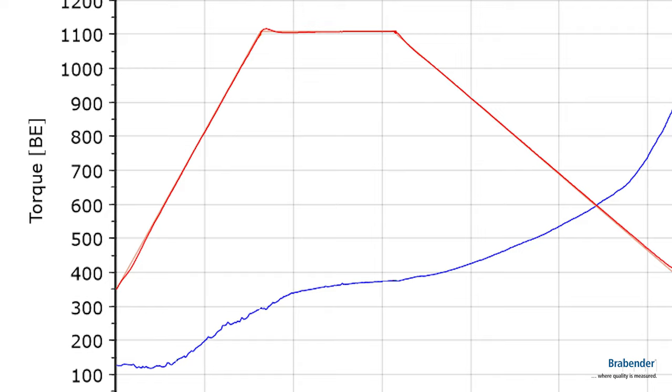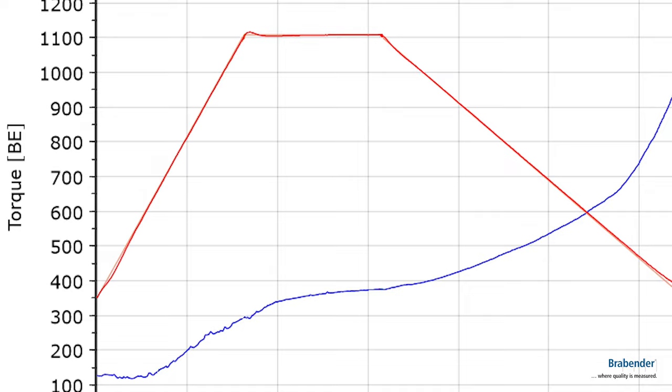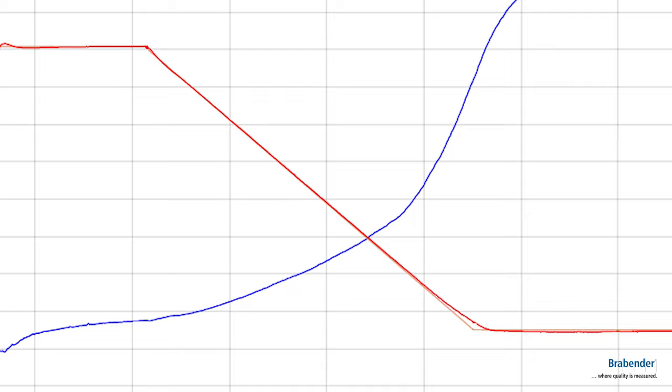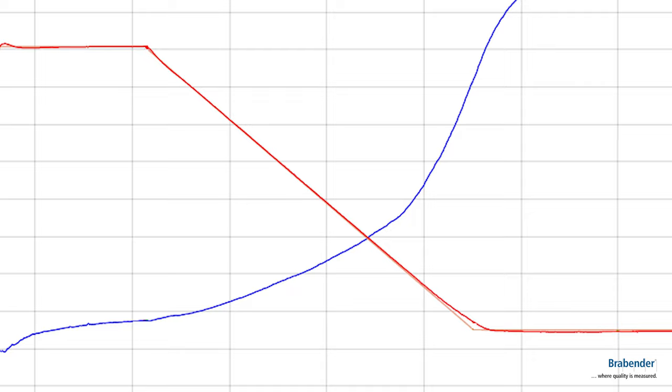During the whole time at hot temperature, the seaweed polymer is released from the cells and going into solution. During cooling, depending on the seaweed composition and quality, it will show a different gelation behavior, which means different gelation torque and different gelation temperature.